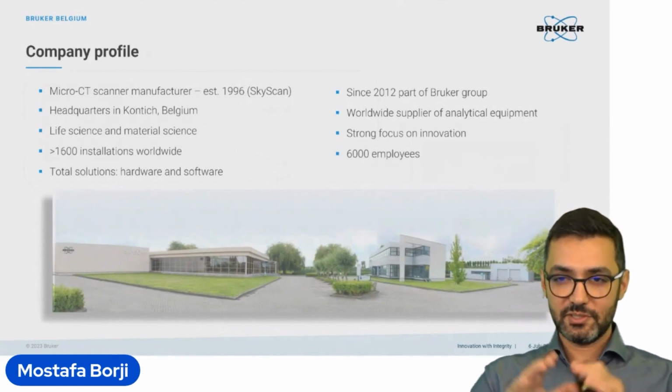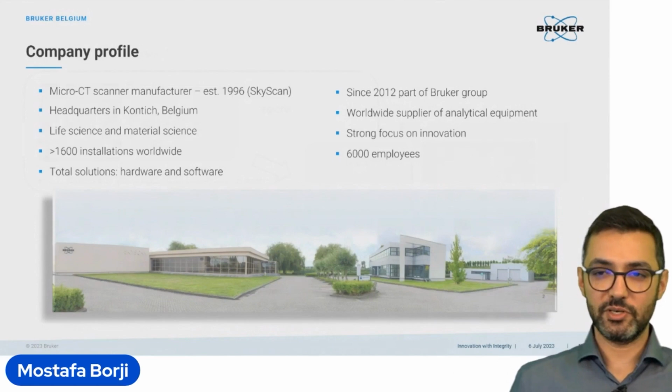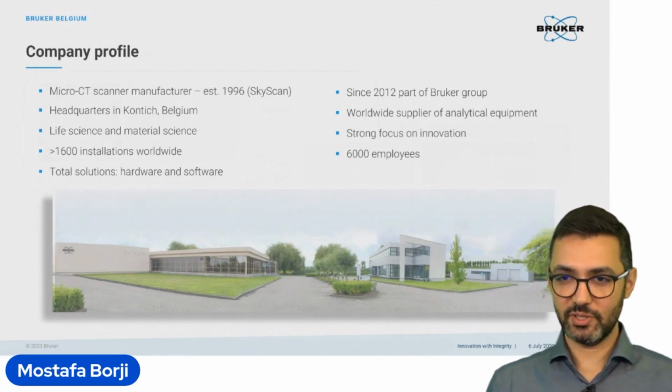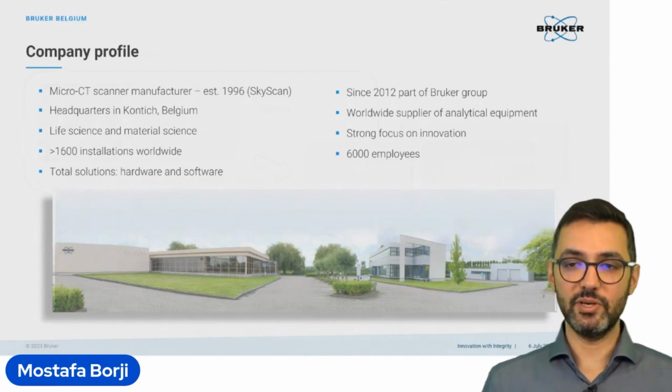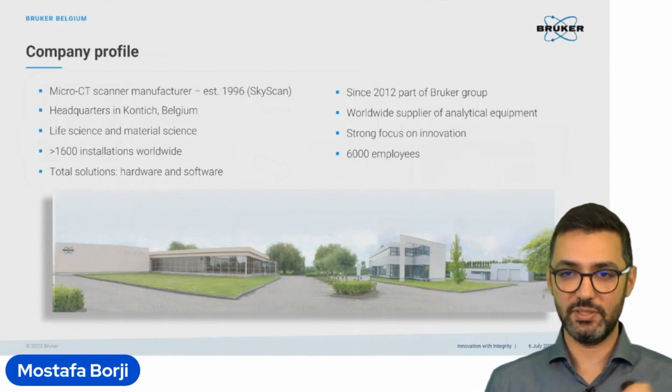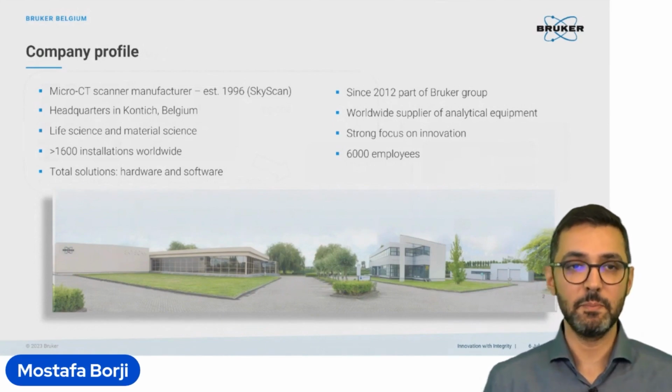So after this small introduction to the XRM technique, I will give you a short introduction about Bruker, who we are, and after that we will have a quick overview of the devices and our micro-CTs.